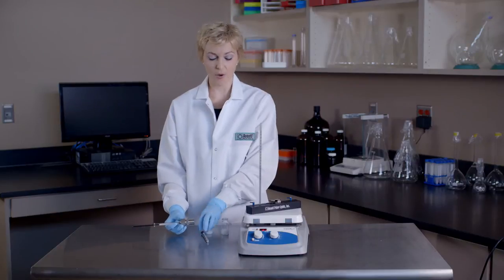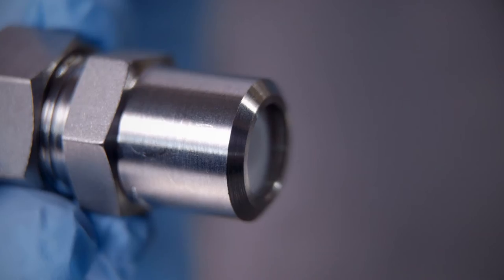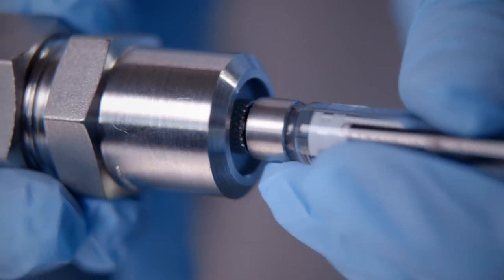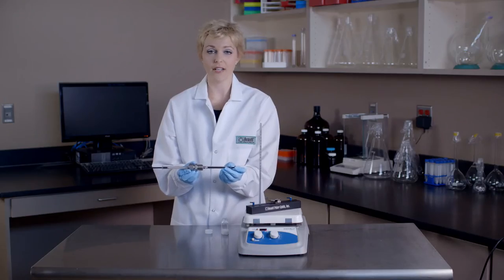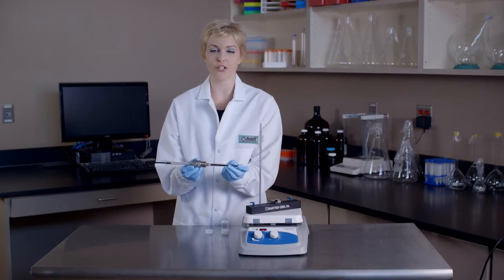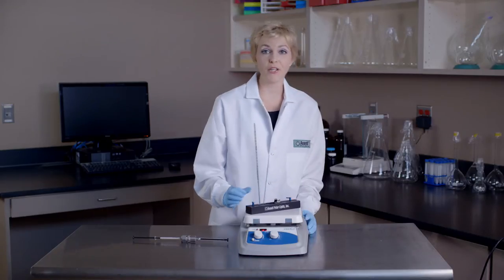Next, we will add our empty gas-tight syringe to the other side of the mini extruder, making sure the plunger of the empty gas-tight syringe is set to zero. This syringe will begin to fill automatically as the lipid is extruded through the membrane. Next, we need to check the temperature of our heating block. The temperature of the heating block must be below 80 degrees Celsius in order to prevent damage to the syringes. Looks like we're below 80 degrees.